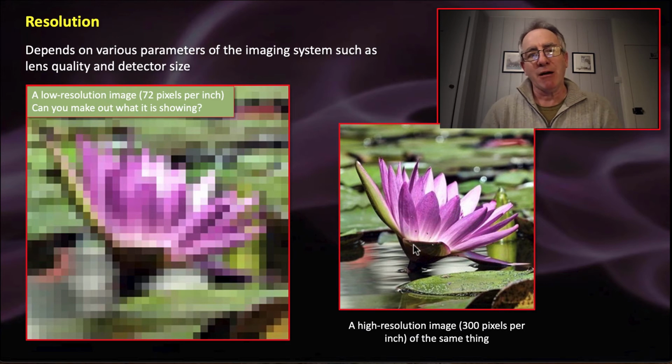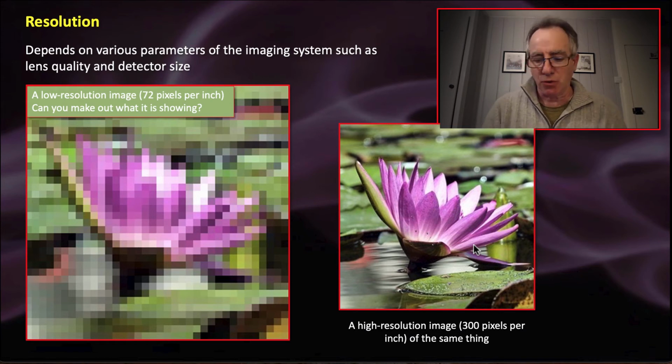And how do we get that? We get that by paying a lot of money. The microscopes in the bioimaging center cost hundreds of thousands of pounds. The microscopes on the bench in the teaching lab cost hundreds of pounds. There's a big difference between the two things. The objectives in the confocal research microscopes can cost 5,000, 7,000, even 10,000 pounds. The higher the price, the higher the resolving power of the objective is the general rule of thumb.